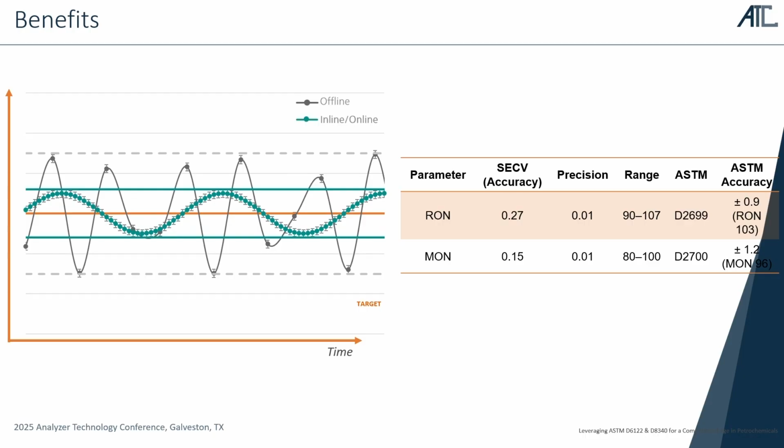If we have spectroscopy implemented, which runs much quicker and is directly implemented into your process, you increase your measuring frequency and you can react to changes much quicker and therefore produce closer to target.